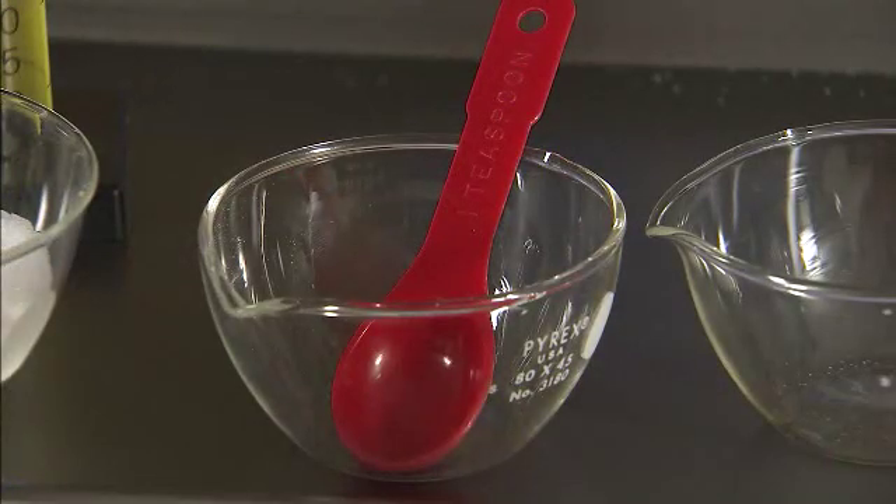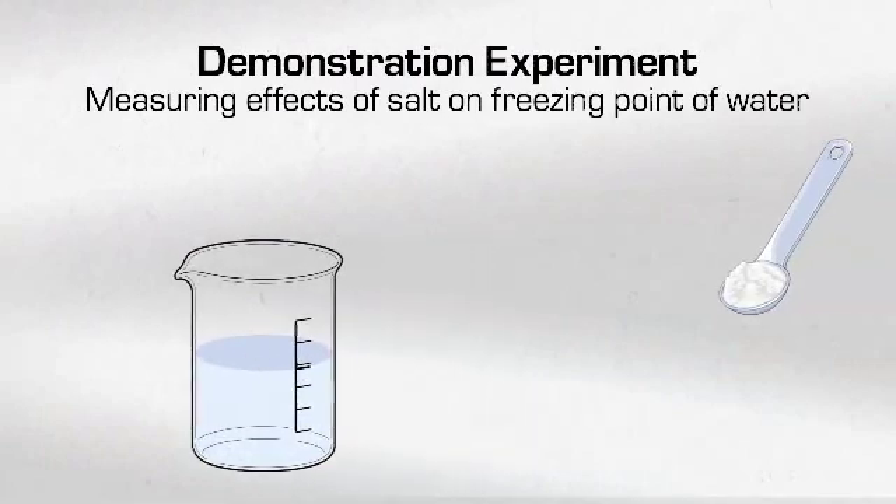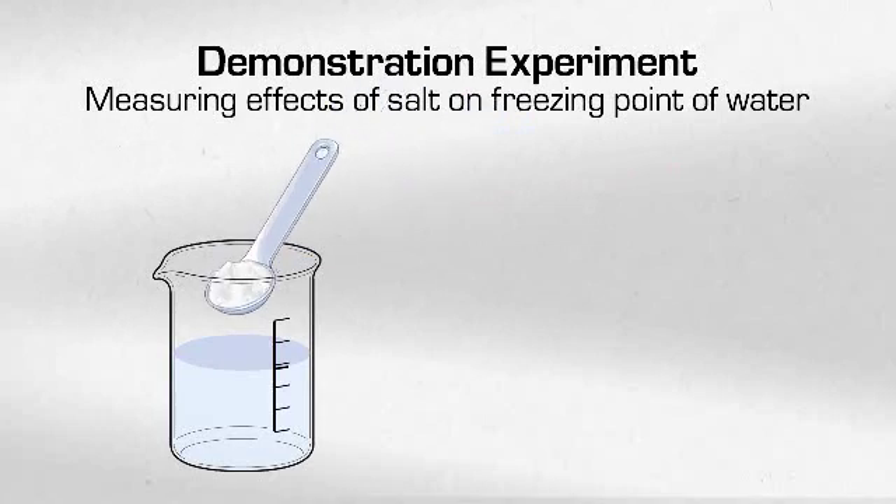As an alternative to the common lab scoop, transferring solids with a teaspoon will minimize the risk of spills. The transfer of any materials should be done over the lab tray. The use of aluminum foil will act as an audible indicator and alert the student to any dropped materials. To demonstrate how these techniques are used in a lab setting, we will measure the effect of salt on the freezing point of water. In this experiment, Aaliyah will add 5 grams of salt to 50 milliliters of water.